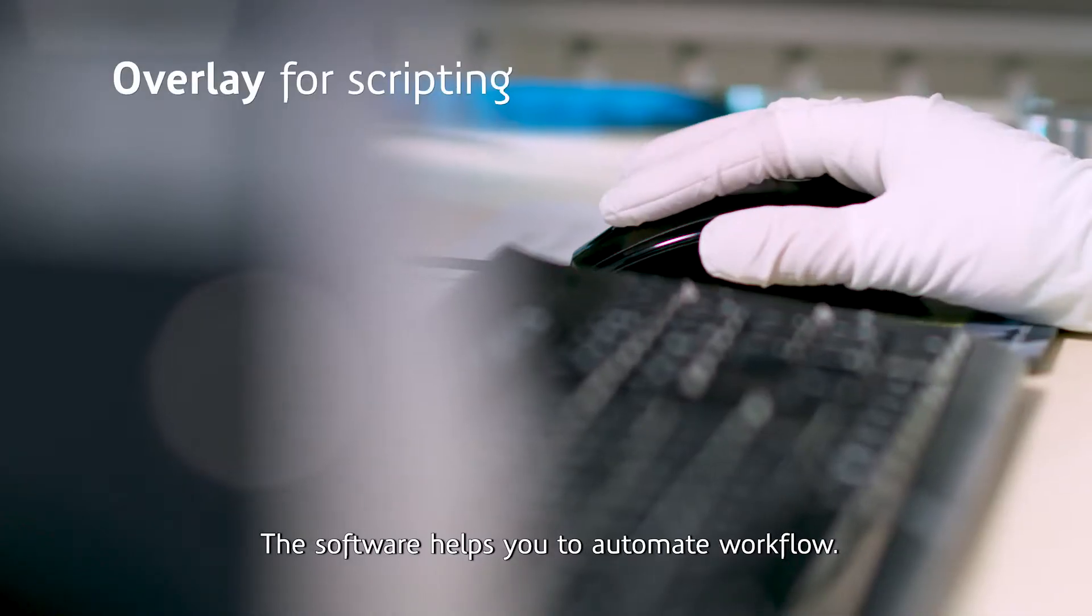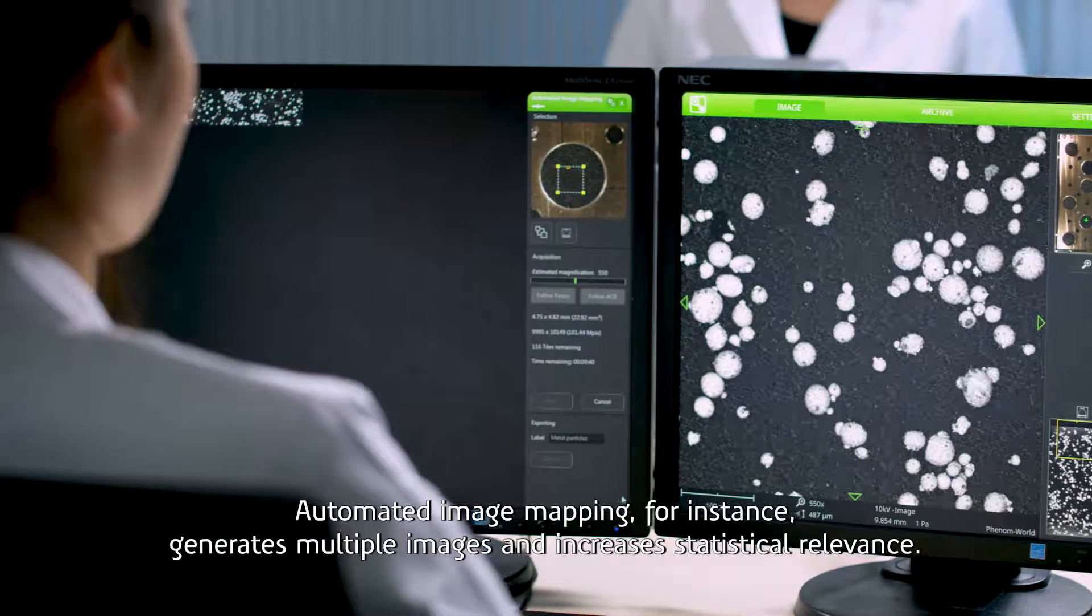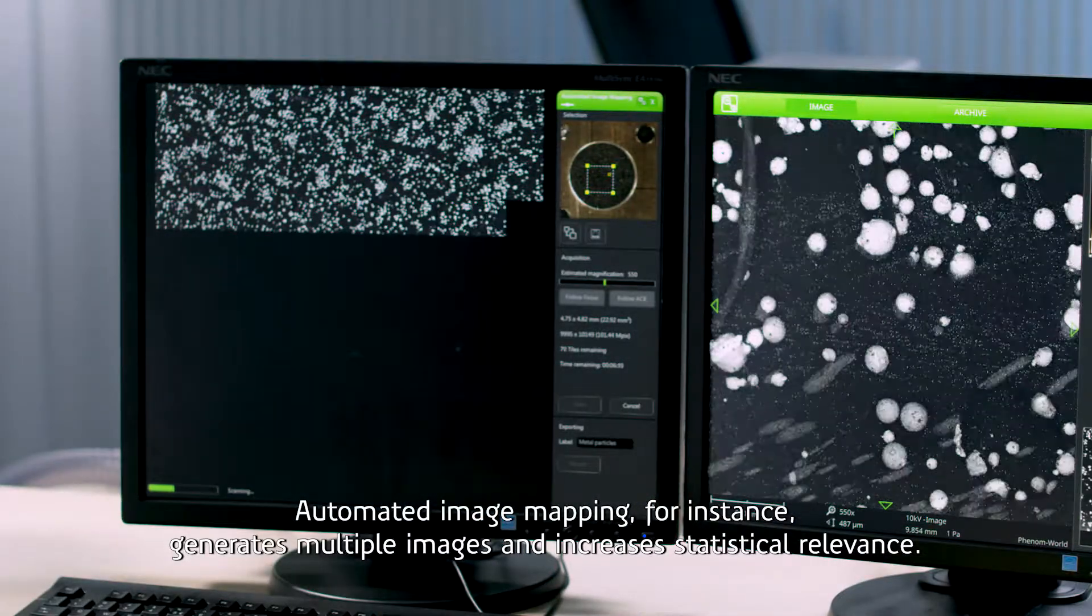The software helps you to automate workflow. Automated image mapping, for instance, generates multiple images and increases statistical relevance.